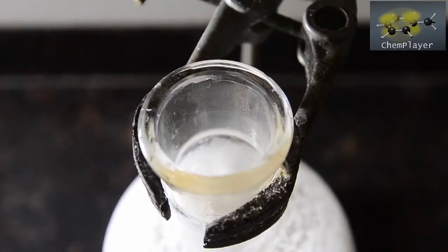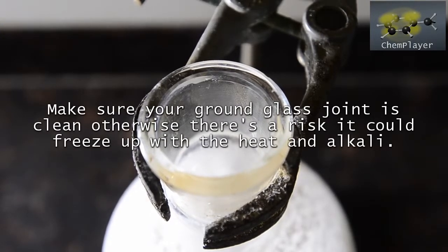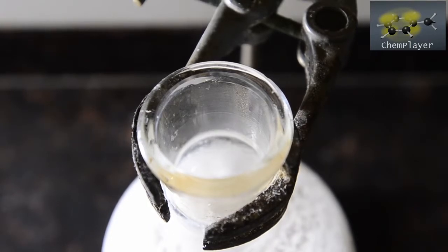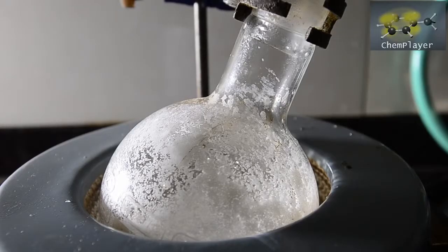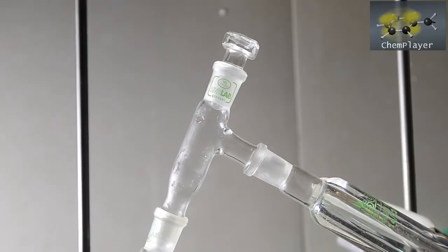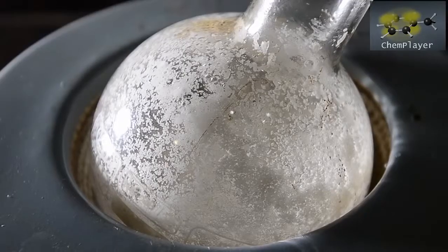We make sure that the ground glass joint of the flask is really clean so that the chances of it freezing up are reduced. We'll also use lots of grease on the adapter we use. So let's set up for distillation. We're using the heating mantle so we can heat the flask very strongly. But first we're going to heat at medium strength so as to allow the neutralization to complete and in order to drive off the water that has been formed. We don't bother with a thermometer as it's not going to tell us anything useful. So we start heating on medium heat.